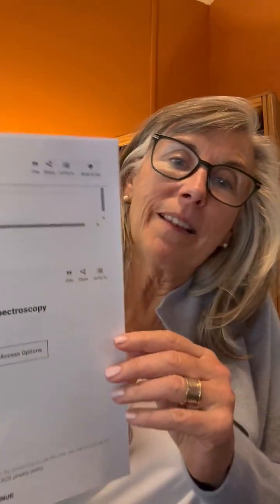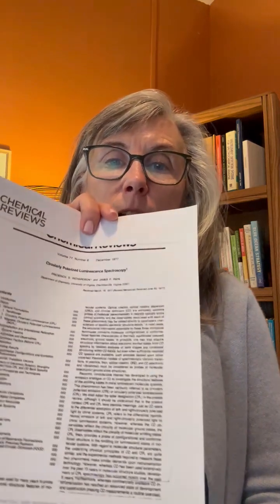Here's an old one that is increasingly relevant today, a 1977 paper entitled Circularly Polarized Luminescence Spectroscopy by Richardson and James Riehl, one might say the founders, the developers of this important technique, which is really increasing in use in the last several years. And I think it would be relevant for us just to look at the introduction to this paper from, again, 1977.